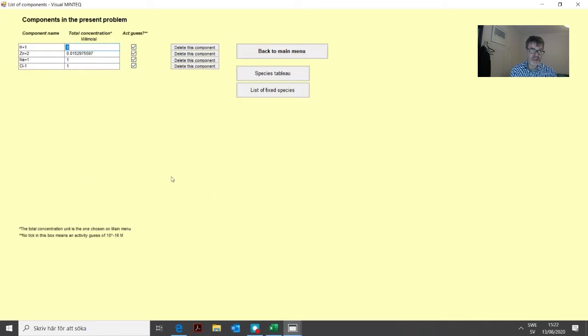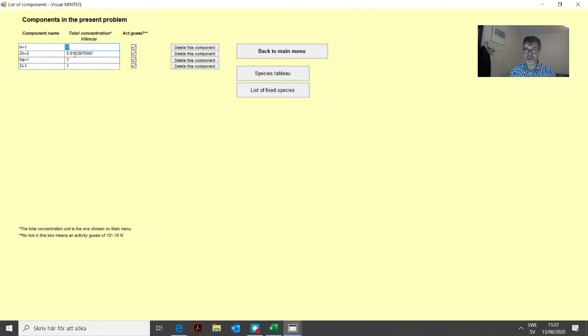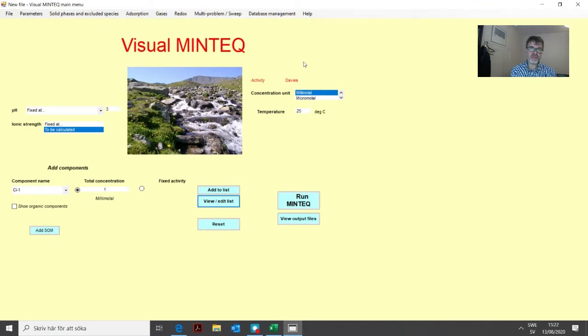Now we've added all that and the list shows we have basically 15 micromoles per liter of zinc, which is the same as one milligram per liter.